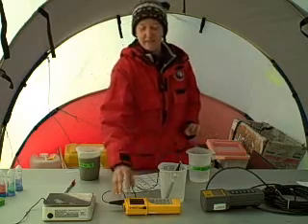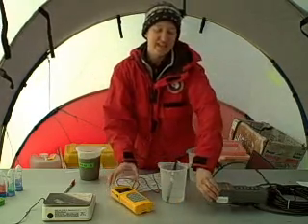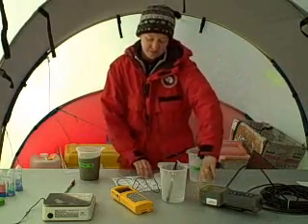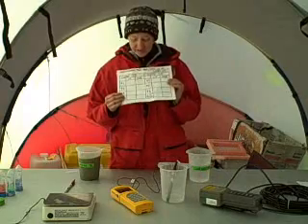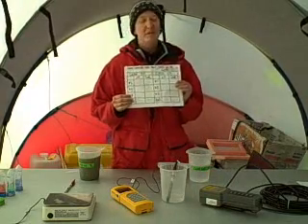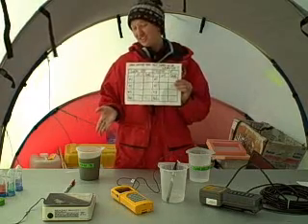We're going to test the pH with the pH meter, and we're going to test the conductivity with the conductivity meter. When we're doing this, we're going to take each one 3 times and record it into a data table, take the average, and we should be able to see if there's a difference in the salt levels between our dirty ice and our clean ice.